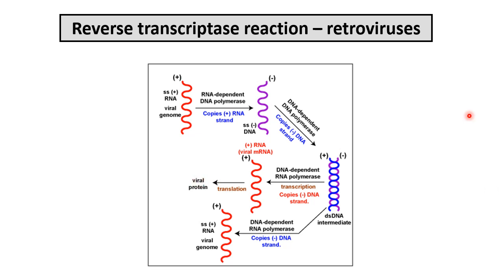And this reverse transcription is widely applied in molecular biology for RT-PCR, so reverse transcription PCR, to synthesize complementary cDNA from RNA template. And in a moment I will explain how it works and what's the purpose of this RT-PCR reaction.